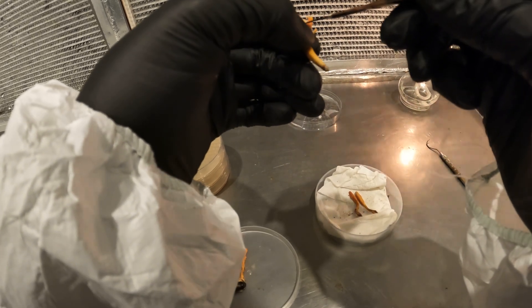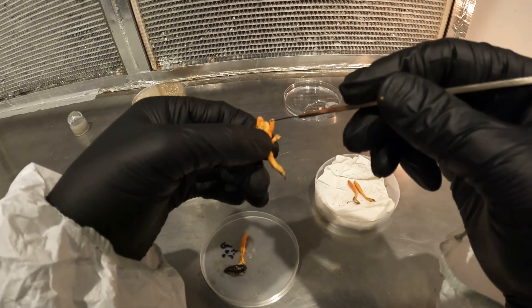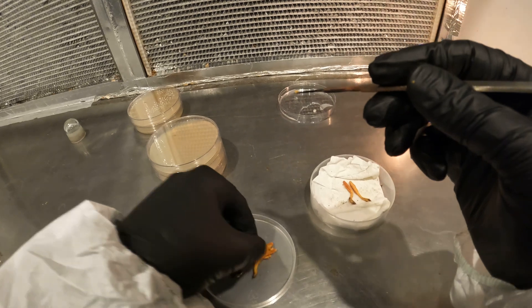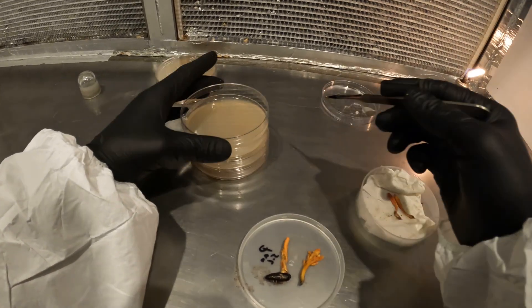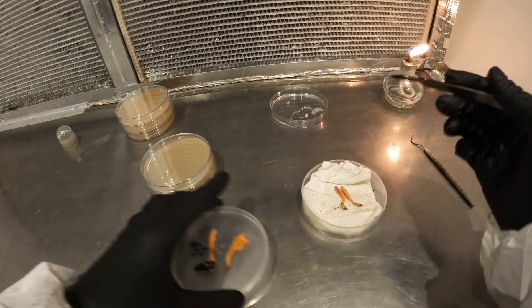I'm just tearing this thing up here — I should have re-sterilized my blade again before going to a new sample, but I'm just giving you guys the basic idea. I'll clean these up and do what I need to do.